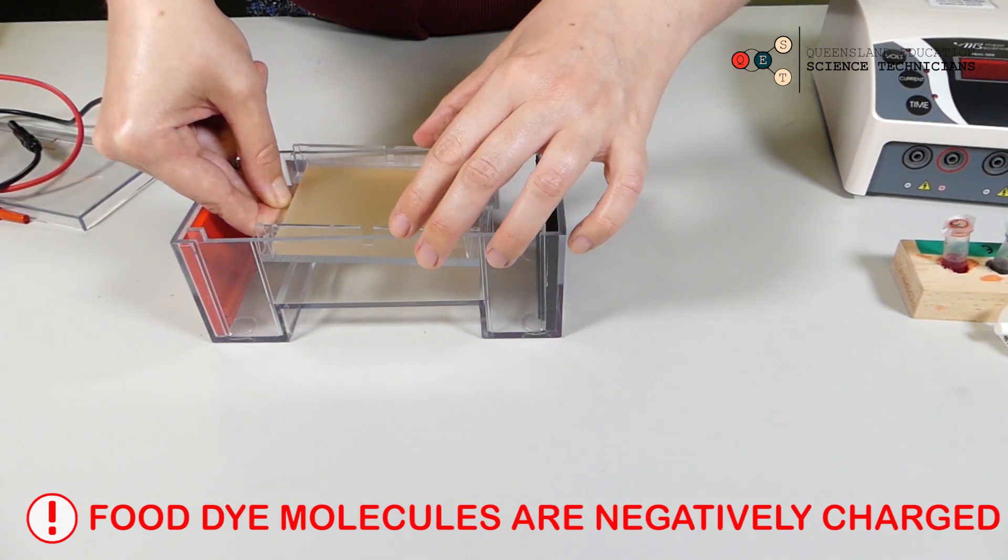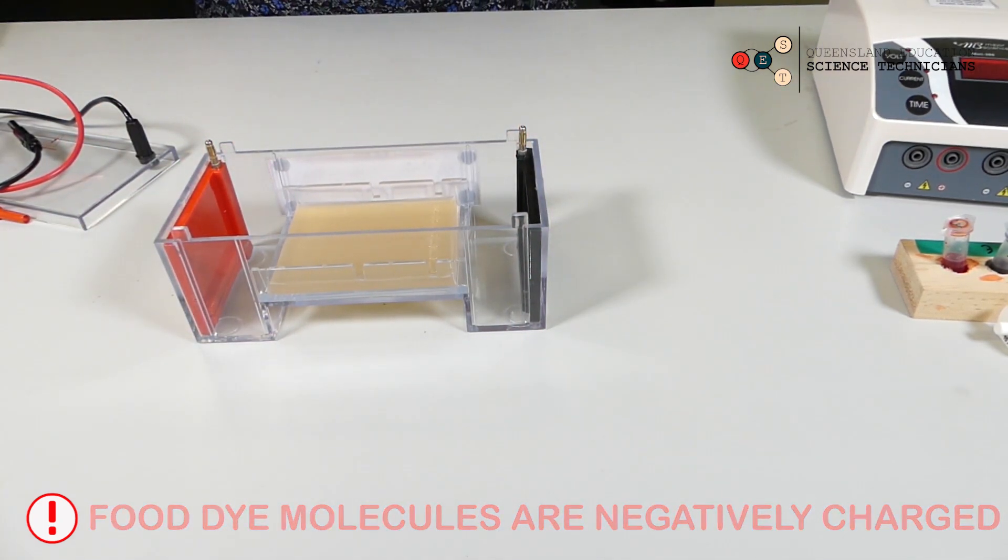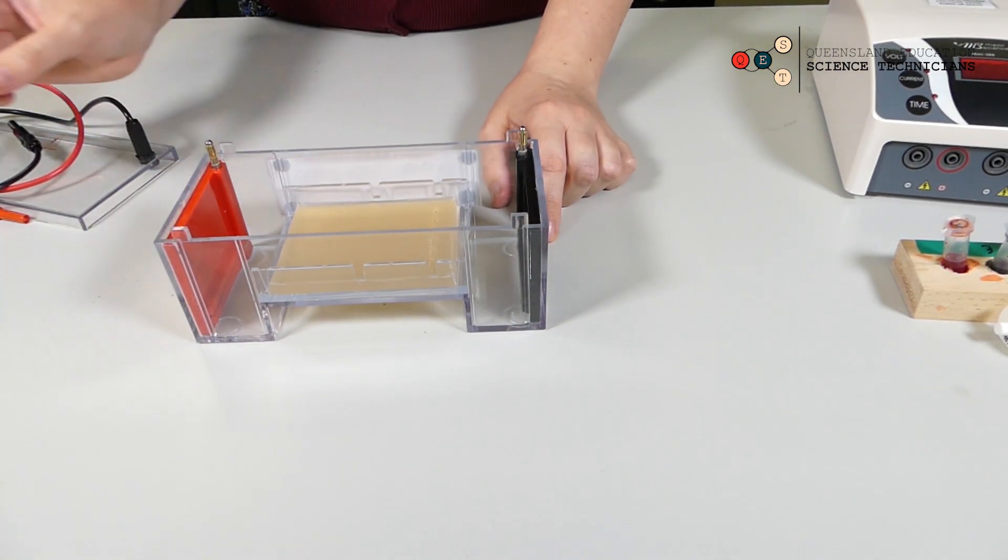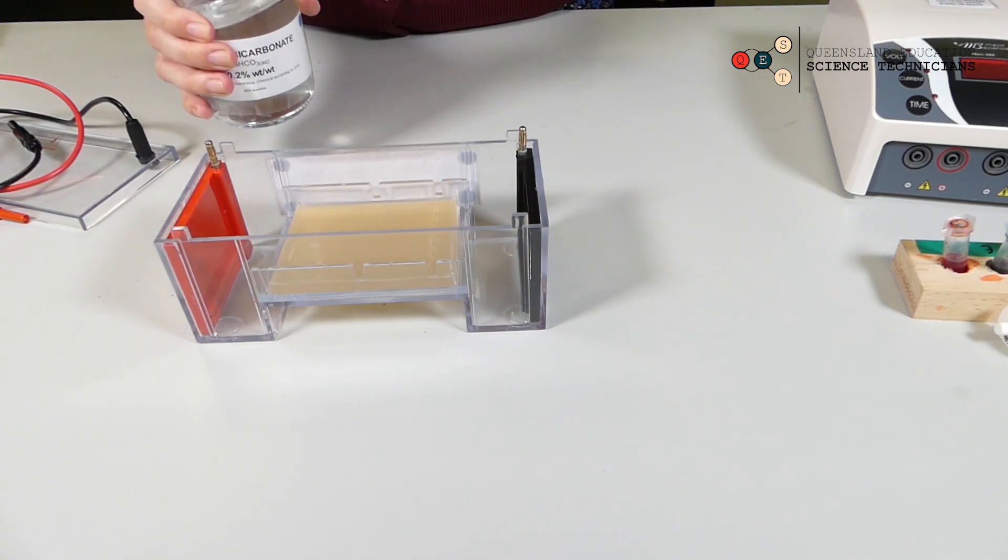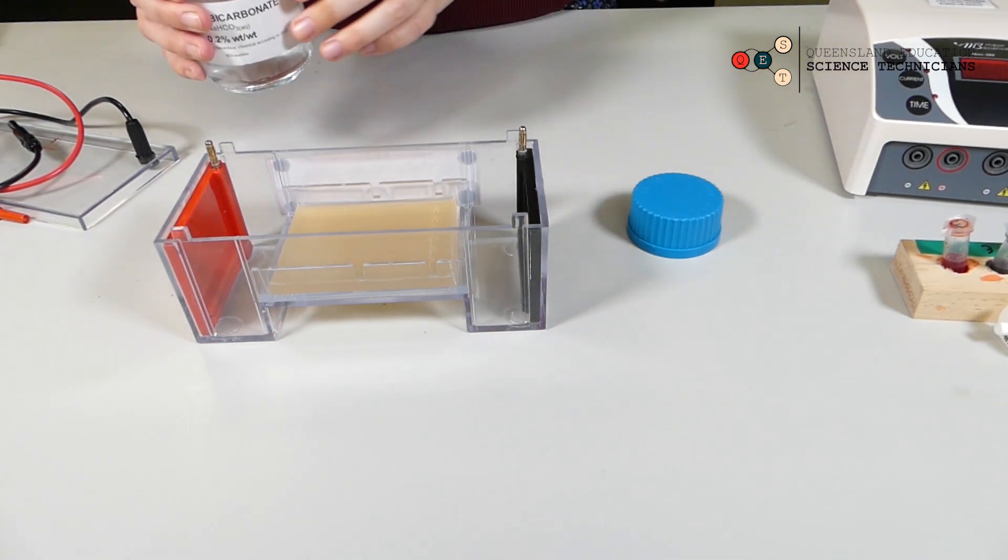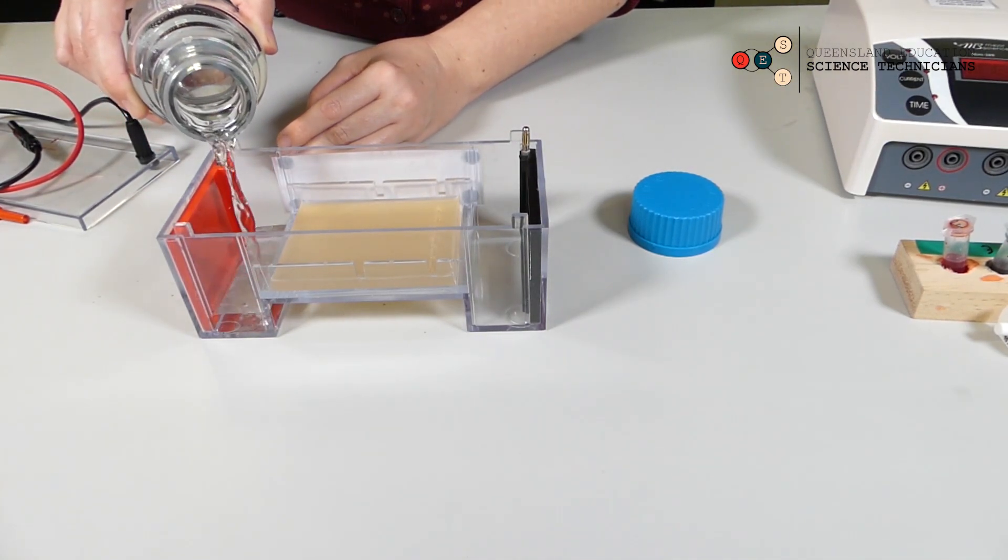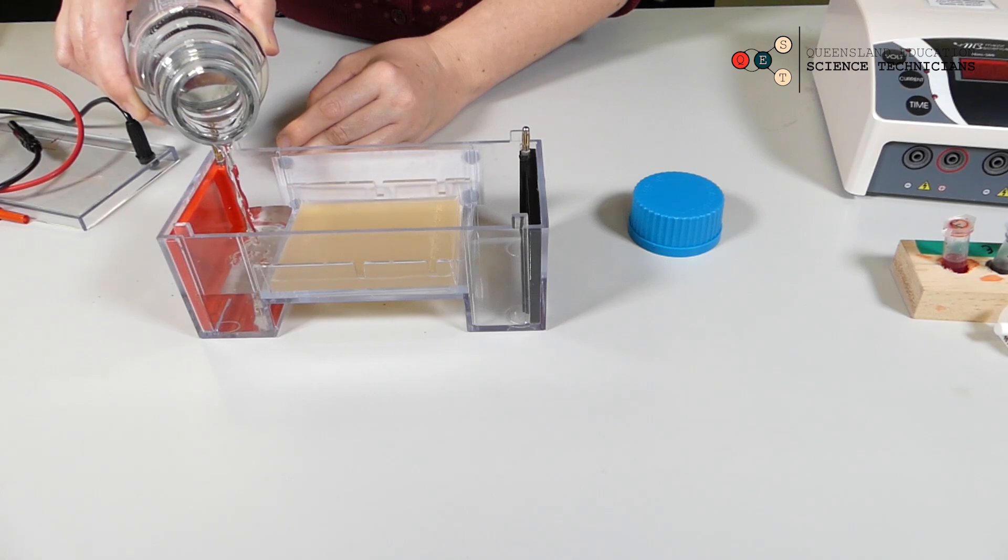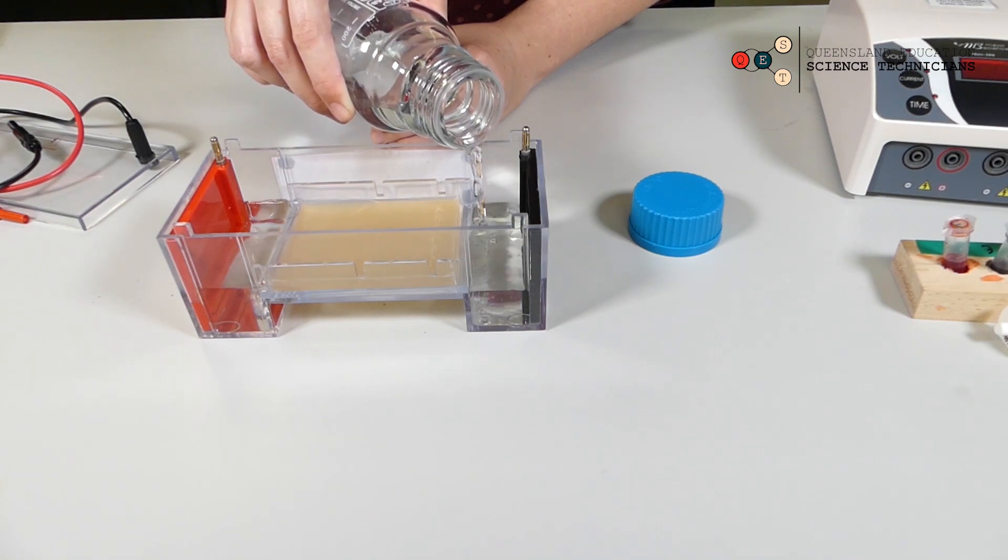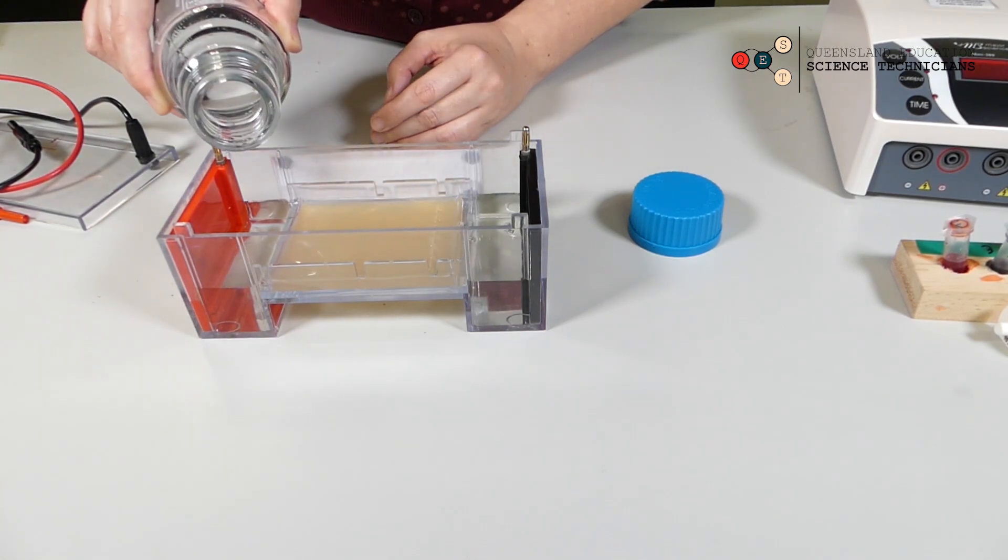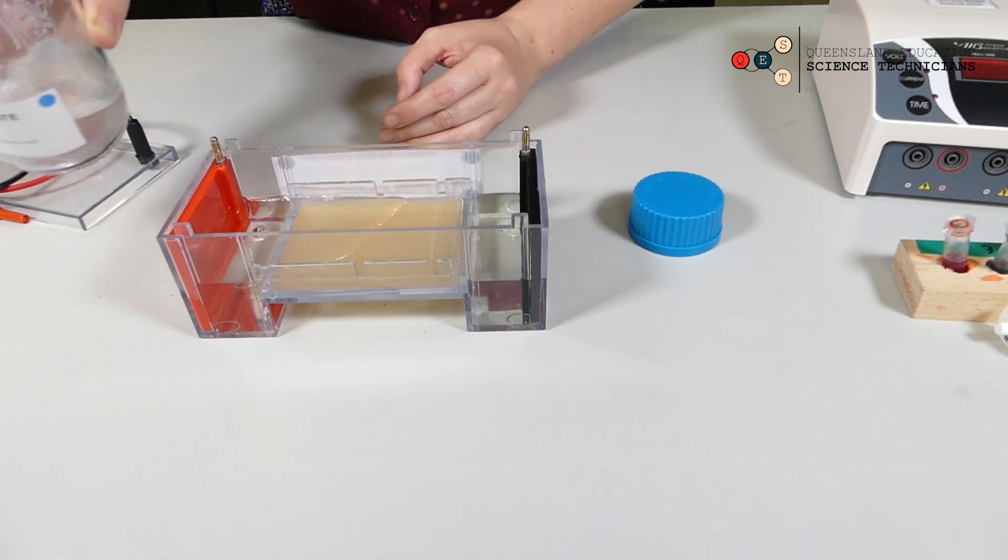So just pop it in there. Now we need to fill our chamber up with our buffer solution. It's the same buffer that we used to make our gel. I like to fill up one end, and then fill up the other end. And you just want it in a thin layer over the top, as thin as you can possibly make it.